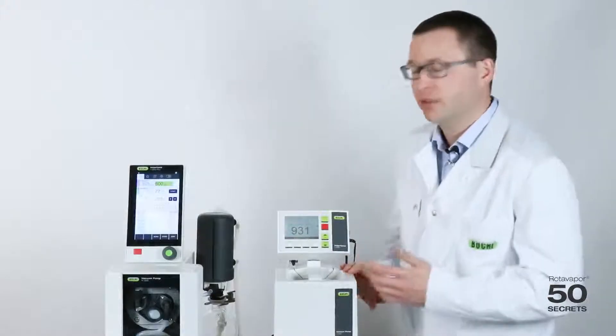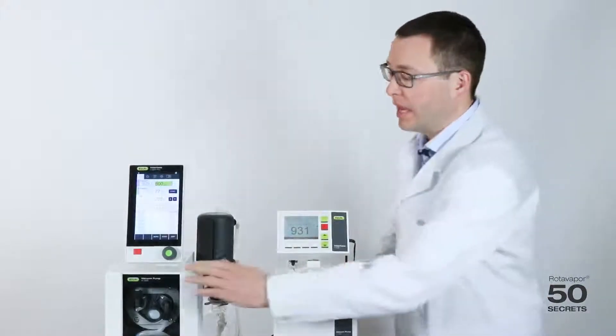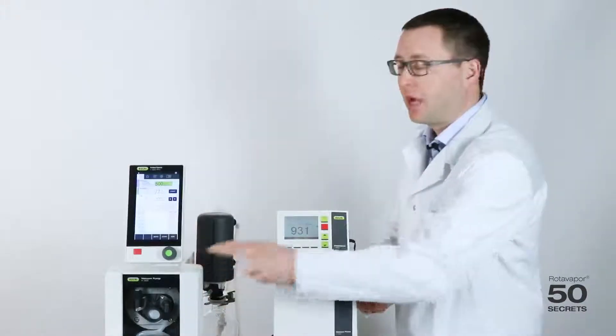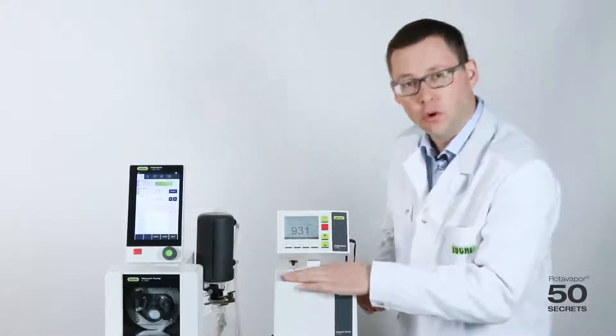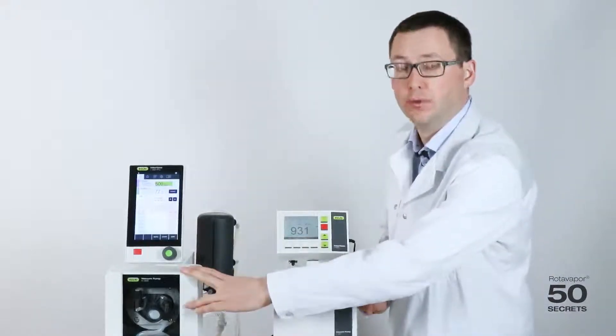Today's secret is about the two different operating modes we have on the V100 vacuum pump and on the V300 V600 vacuum pumps. I would like to explain the on-off operating mode and the speed controlled operating mode.